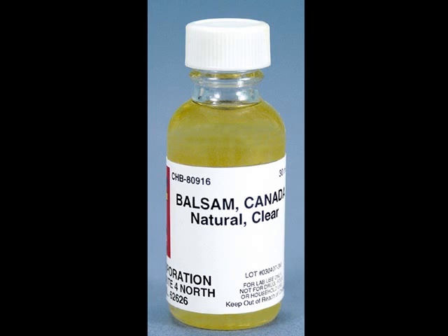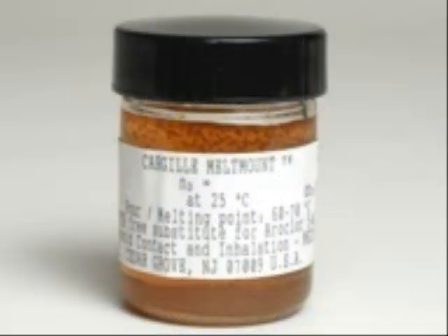The advantage of using Canadian balsam is that the slides of specimen can be stored for a long period of time. There are other modern mounting medium that may have similar storage ability, but Canadian balsam has been around longer and is usually an analyst's first choice. A disadvantage is that this mount requires toxic solvents when preparing the specimen. It is also not very cheap to obtain.